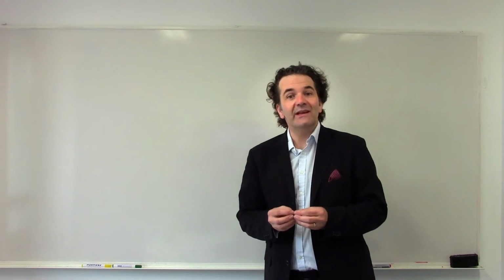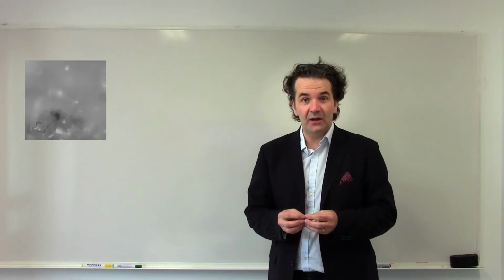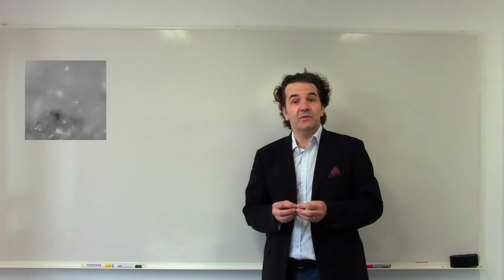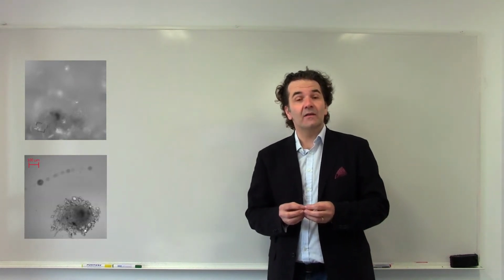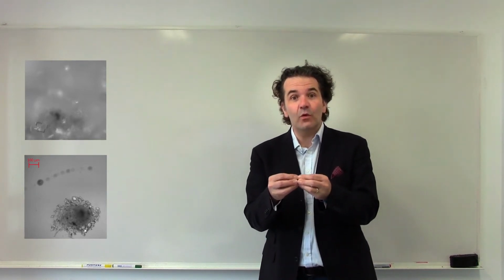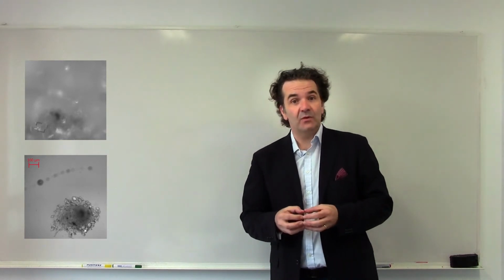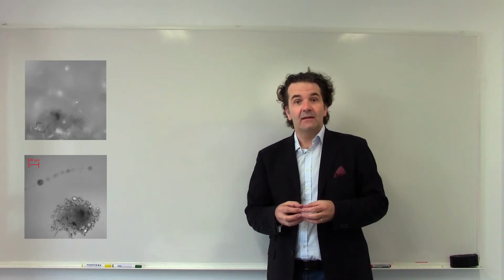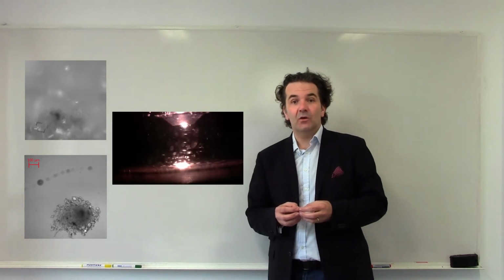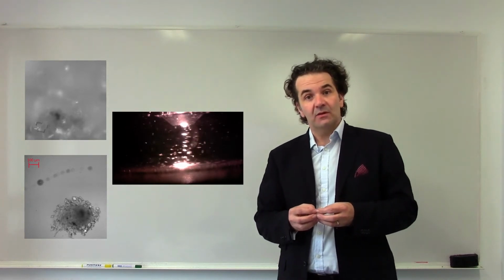Now in this example we look into the direction of the sound propagation. On the left hand side, this is not a bad picture, it is particles and most of them are not in focus. Of course when we switch on the sound, then all those particles come to a position which was clear before, so the instrument is focused there and you see all those crystals forming at the same time. You can observe them, you can keep them, you can observe them over time. And the right hand side picture is from the side, and what you see is the particle agglomerations between this 90 mm Raman spectroscopy probe and the ultrasonic transducer.